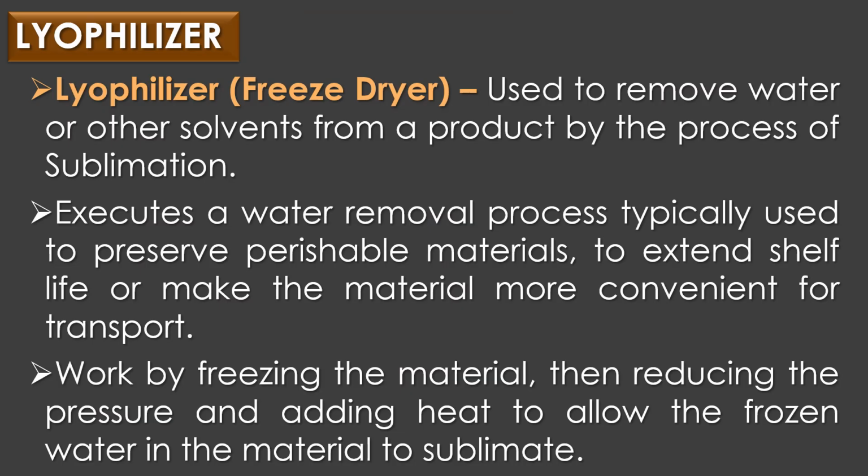Lyophilizer. A lyophilizer is also known as freeze dryer. It is a device used to remove water or other solvents from a product by the process of sublimation. A lyophilizer executes a water removal process typically used to preserve perishable material, to extend shelf life, or make the material more convenient for transport.